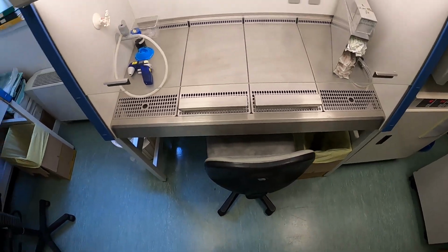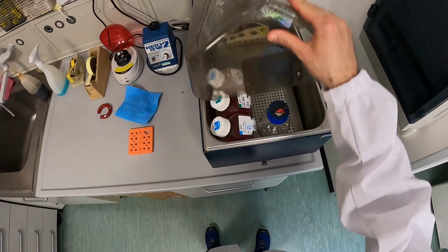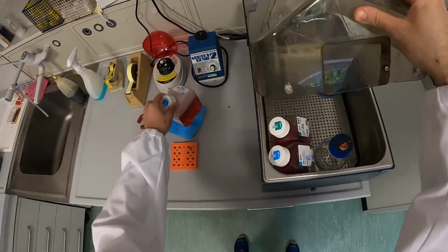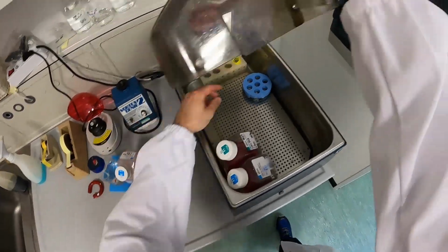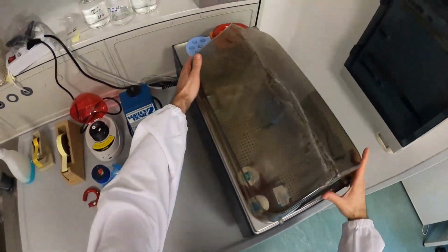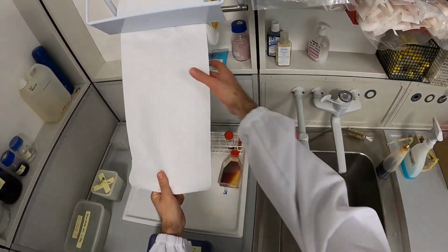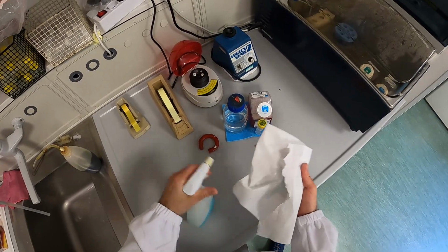Okay, so now let's get some important things. You have warmed up your cell medium, the DMEM plus fetal serum. You've warmed up the PBS and you have a tube of trypsin. And I think it's important to place them in a water bath, which is at 37, in order to avoid a cold shock to the cells. So keep everything roughly at the same temperature.